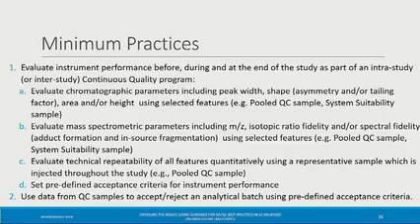Hello, Diana. I have a follow-up question or comment on pooling the QC prior to or after extraction, because so far I have been doing it prior to extraction, as you mentioned, and I think it's the most standard in the community. But what I have faced many times, even if you don't have a super large number of samples, like if you have 300 samples, you would inject, let's say, 50 times, right? So if you prepare different replicates of the QC, you might have a slightly higher relative standard deviation for one. It's the extraction variation that you are adding up.